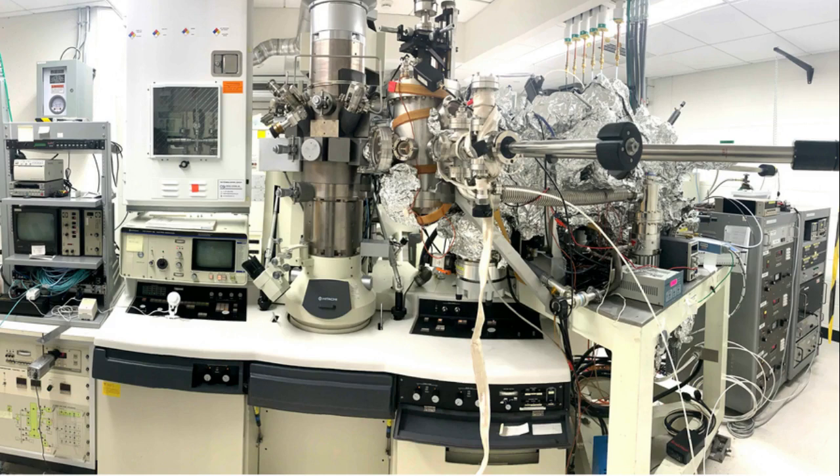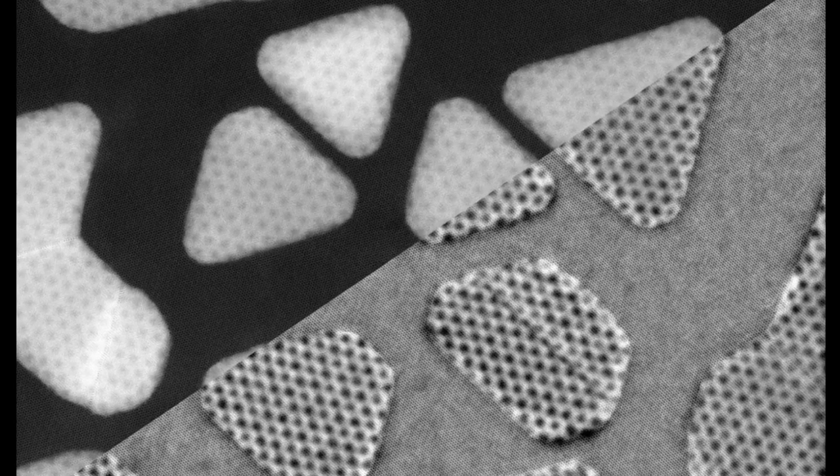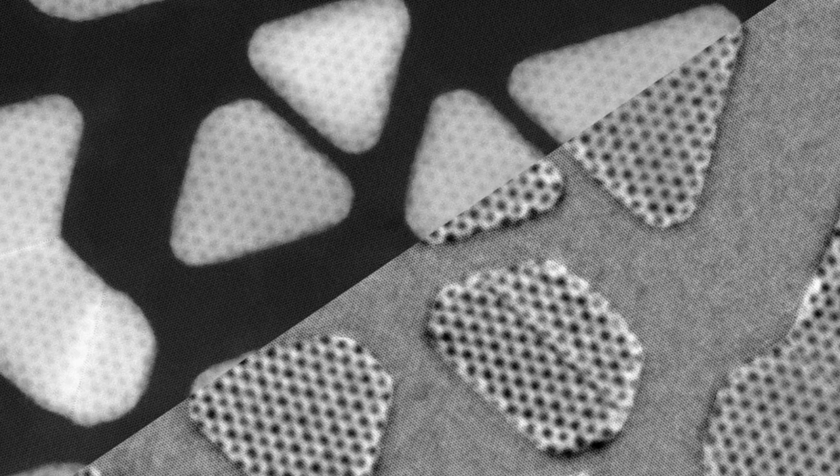Having grown the materials, they then had to figure out how to reveal the atomic configurations and orientations of the different layers. A scanning transmission electron microscope actually produces more information than is apparent in a flat image. In fact, every point in the image contains details of the paths along which the electrons arrived and departed, as well as any energy that the electrons lost in the process. All this data can be separated out so that the information at all points in an image can be used to decode the actual solid structure. This process is only possible for state-of-the-art microscopes.